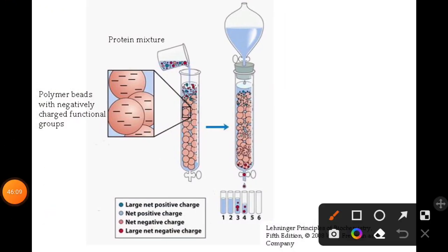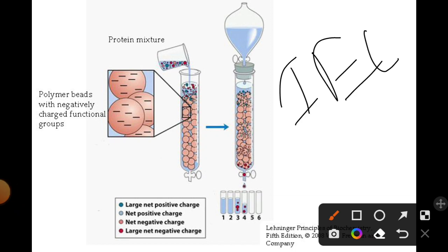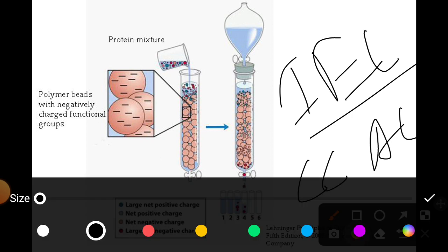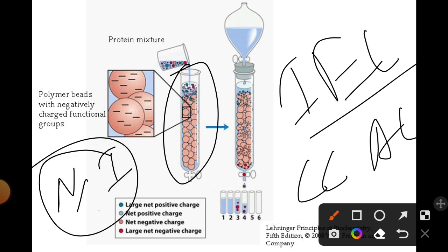Before that we talked about ion exchange chromatography. Here we discussed cation exchangers and anion exchangers. Ion exchange chromatography's advantage is that it helps you to separate proteins on the basis of their charge, the life of the resin is long, it is cheaper, and it deals with only environmentally friendly compounds. The disadvantages are the nature and interaction of the ion exchange resin and the nature of the exchanging ions.